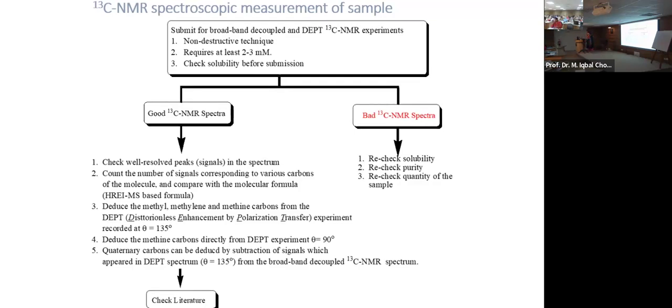And the reason behind it is that in earlier days there were other techniques, which are difficult for me to explain right now because we haven't shown you the spectrum. Some of you may understand the J values, right? Who has seen a proton NMR spectrum? The J value is because of the coupling of one proton with its neighboring proton, right?